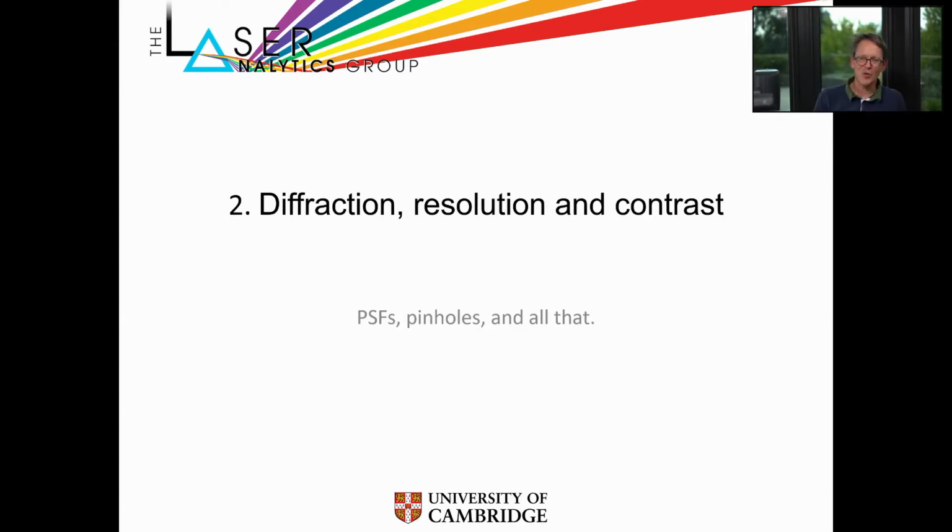So in this lecture, we are going through the basics of the imaging process in an optical microscope, and we define the three concepts that are all important to this course, namely diffraction, resolution, and contrast. To get good images in a microscope, it's not enough to just get large magnification. Magnification is useless if you don't get images that have good contrast. And so diffraction is what limits our resolution, and there are other things that limit our contrast, and we need to be able to differentiate between those two things and understand them.